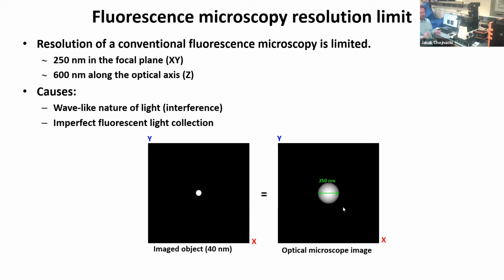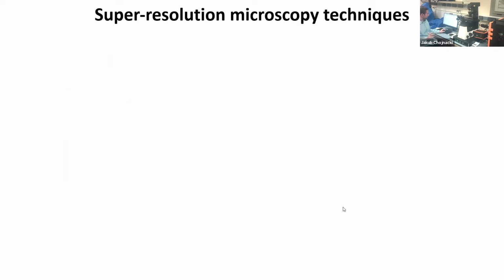But in the early 2000s, this changed. Around the mid 2000s, let's say 2004, 2005, a new concept started emerging in fluorescence microscopy, called super resolution microscopy techniques. And what does that mean? Effectively, very, very clever people tried to come up with a way, not so much to break this resolution barrier, because the resolution barrier is down to physical laws, but more like to cheat it a little bit, to overcome this resolution barrier and allow the fluorescence microscope to see things below this 250 nanometer limit.